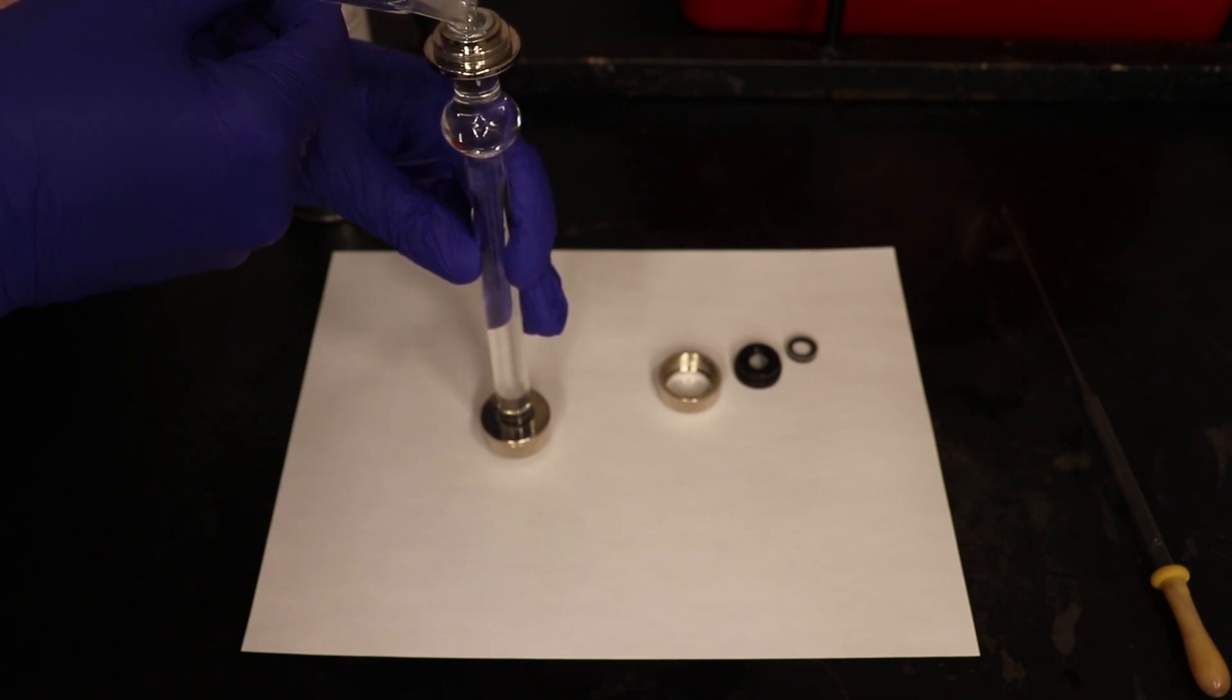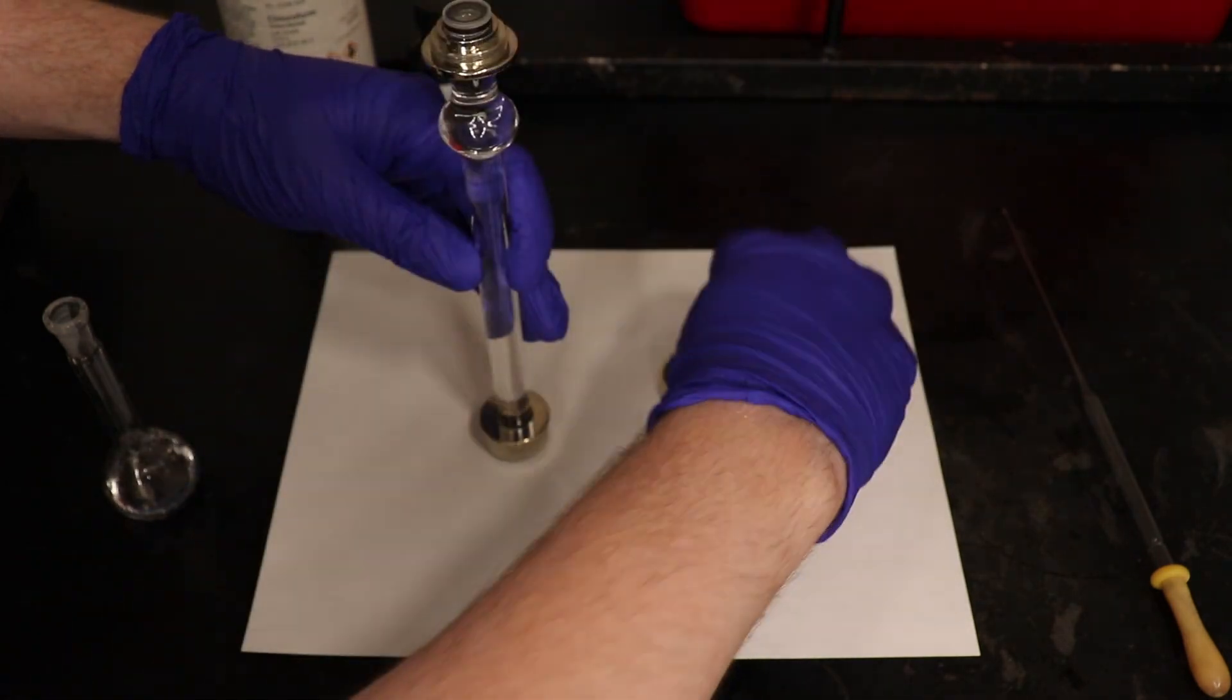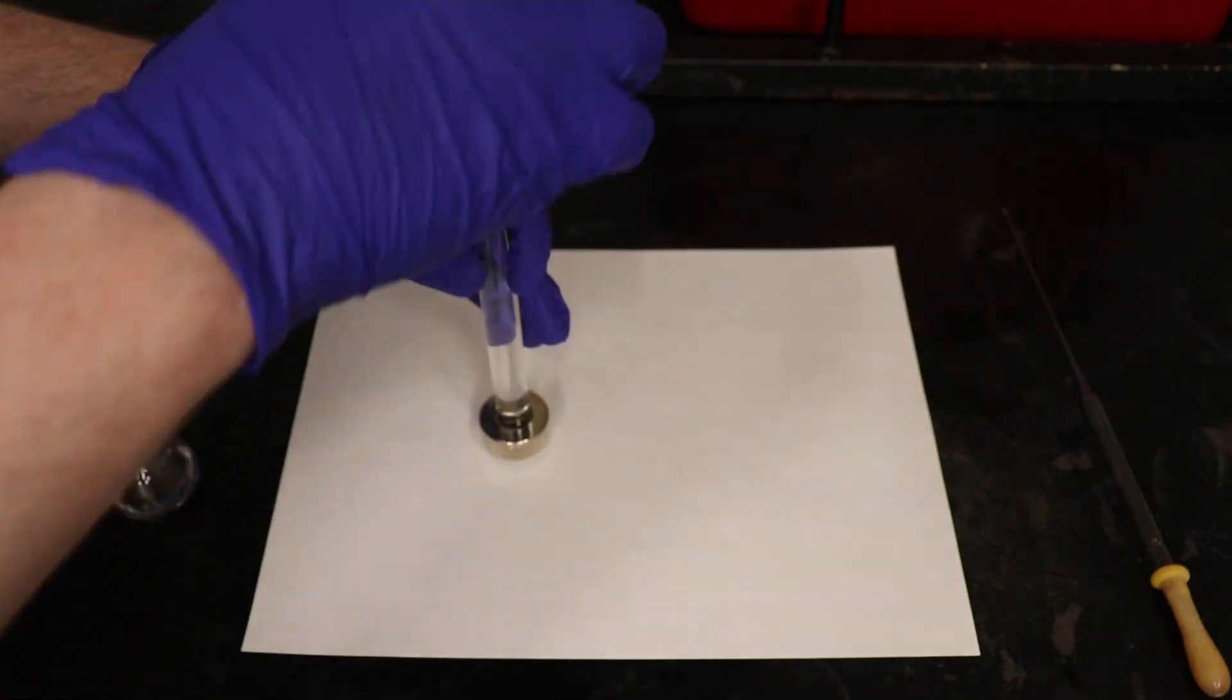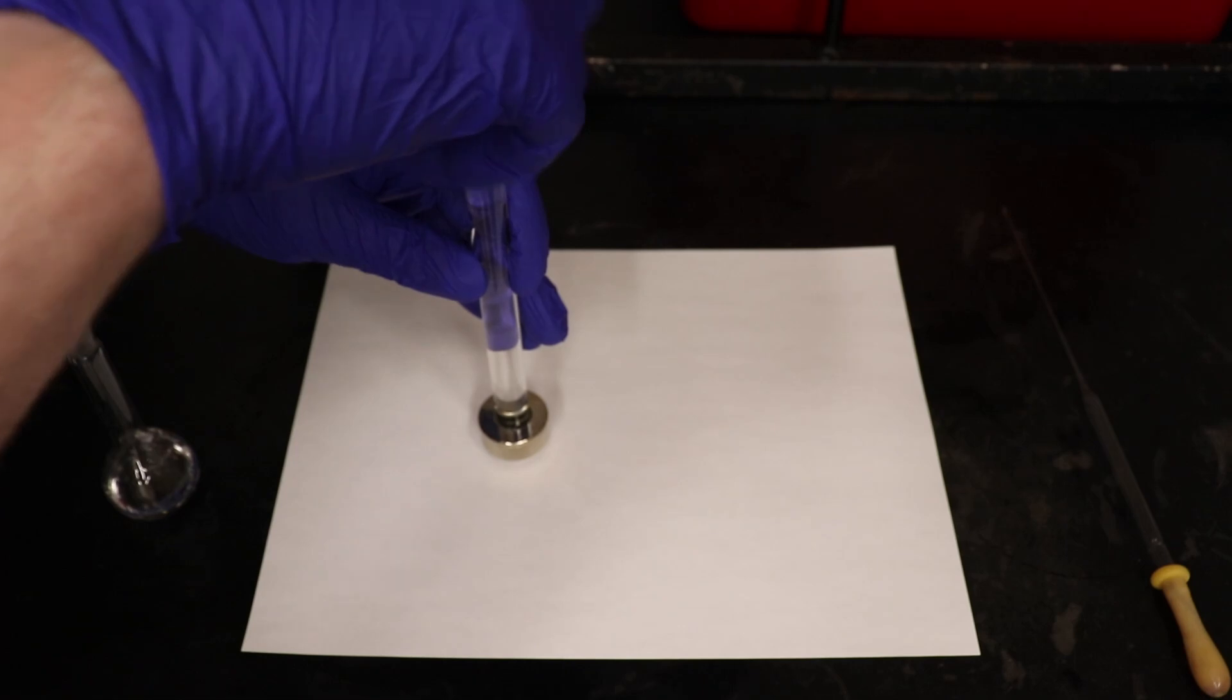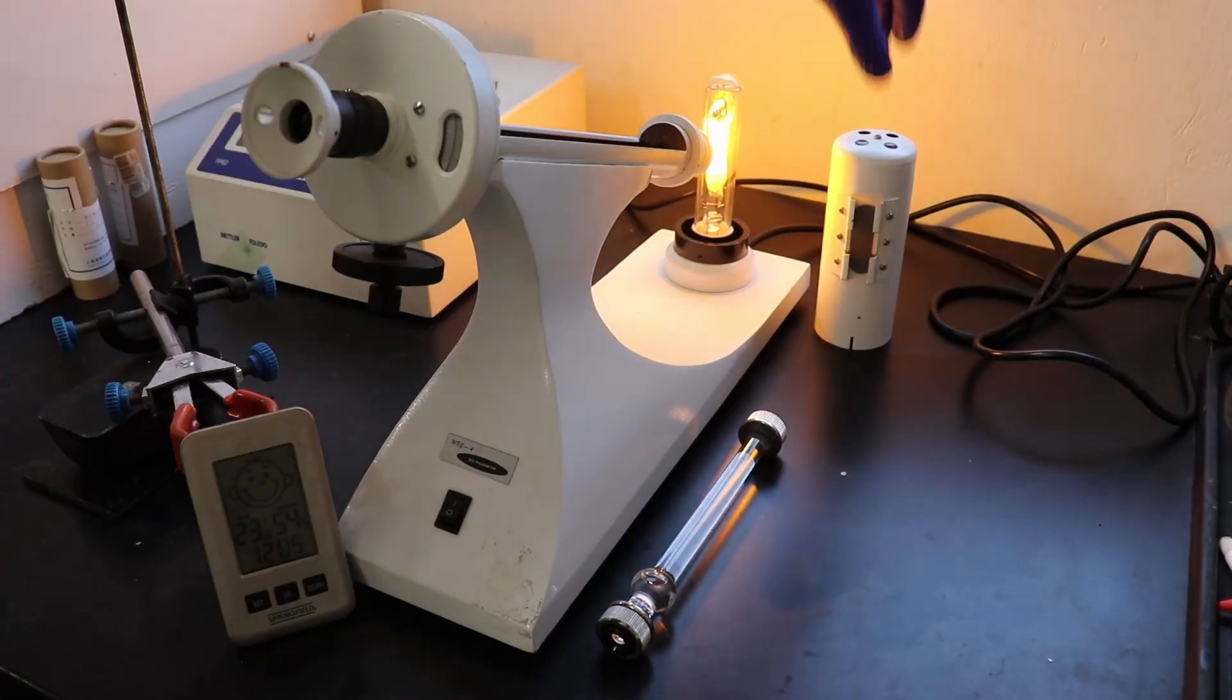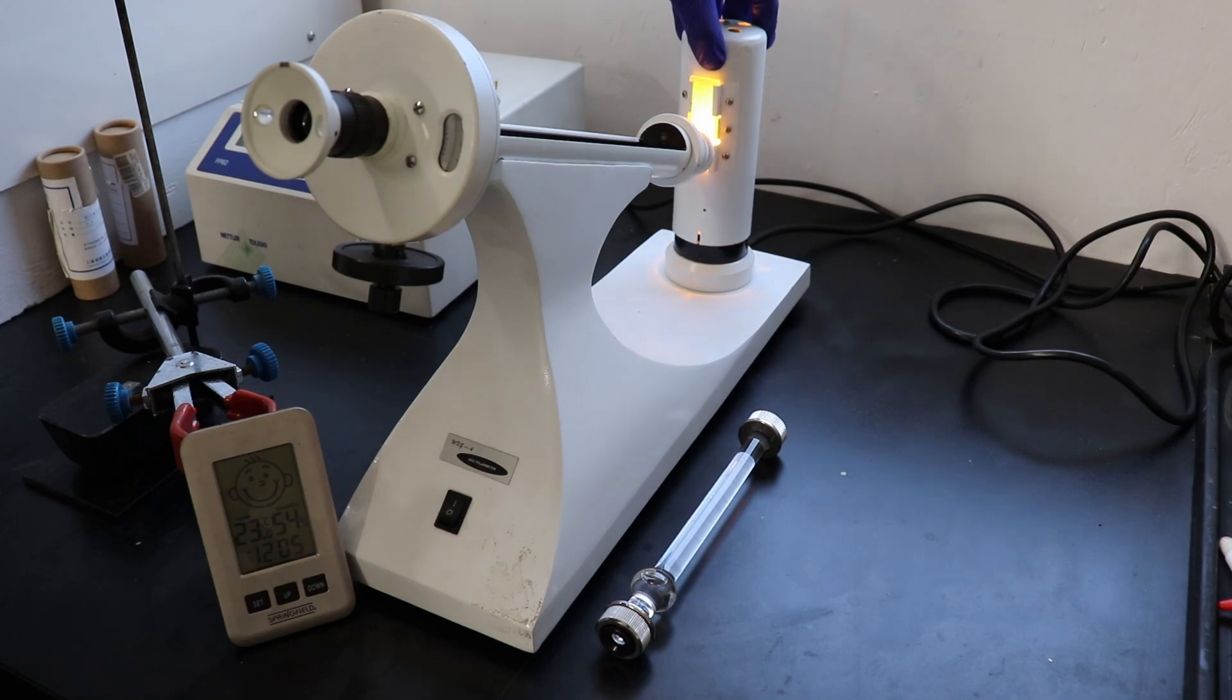To acquire this measurement, I first prepared a solution of the sample in chloroform with a concentration of about 4.24 grams per 100 mL. This solution was then transferred into the polarimeter cell and loaded into the polarimeter.